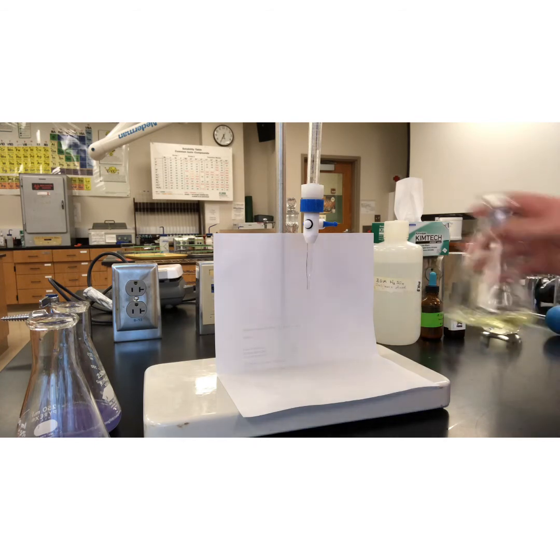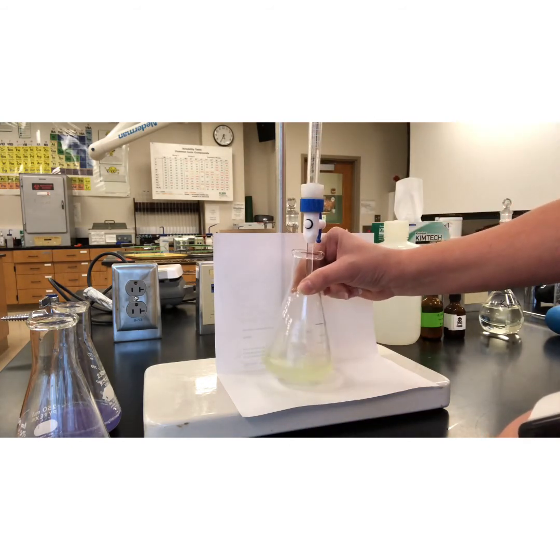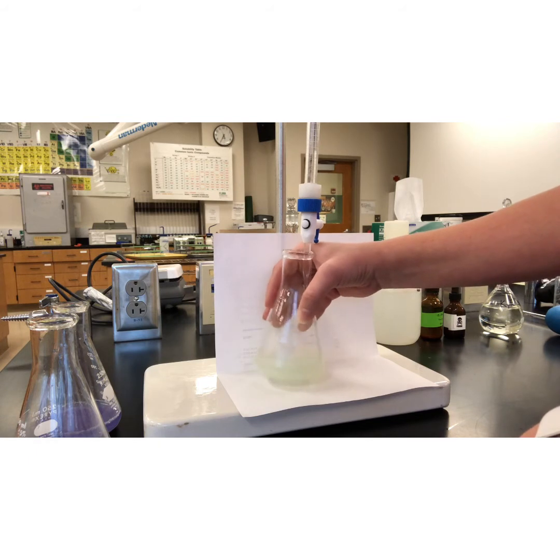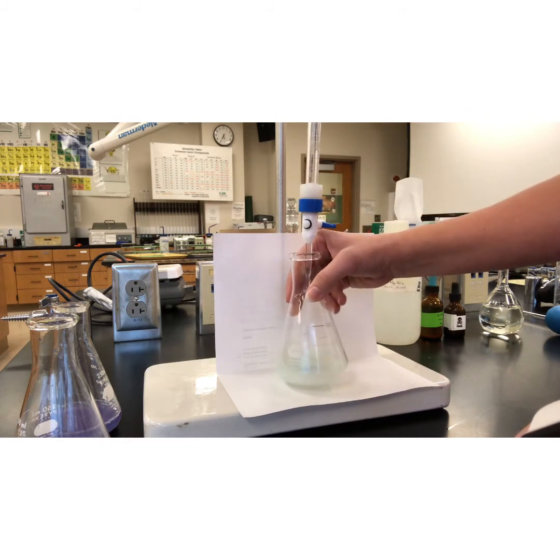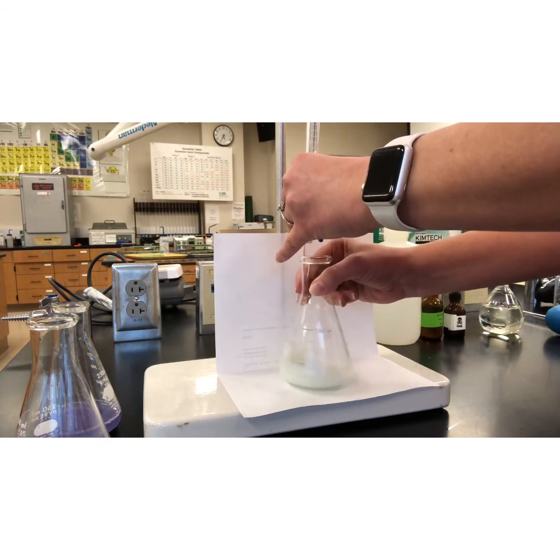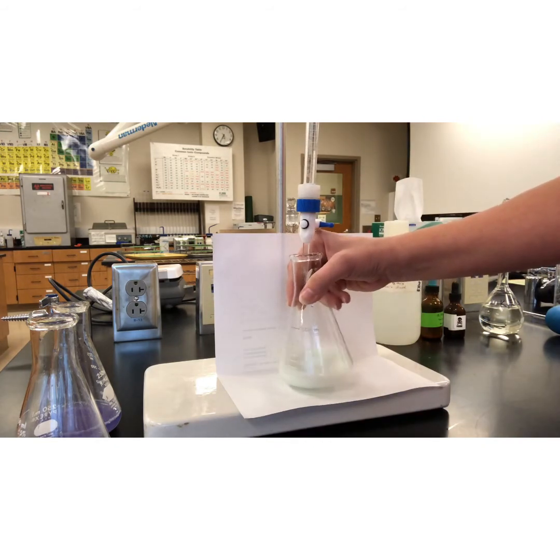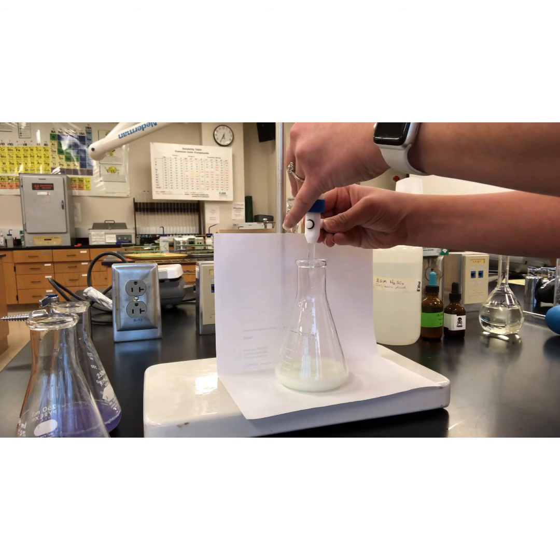Okay, let's get to titrating. Close to my endpoint, so I'm going to go ahead and slow down my flow to drops.